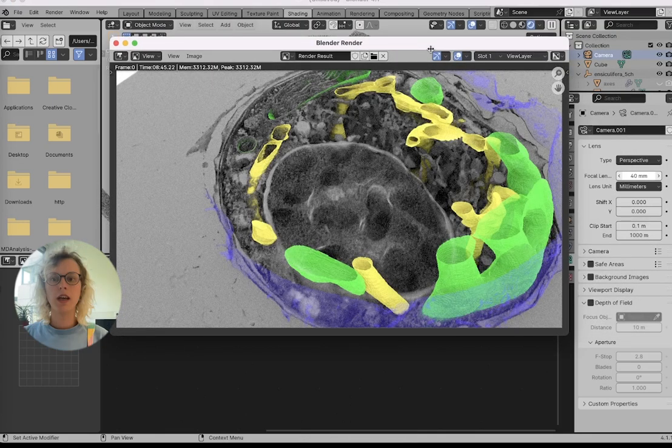So this took a little bit longer to render, and this is for just one frame. We had 8 minutes and 45 seconds. There are some render settings that you could change to make this a bit more doable, but it is this thing where collisions between meshes and volumes and how light paths should be within them is a bit difficult. But you can see that now in this depth, you can really see the mitochondrial cage going through the volume itself, which I think looks really cool. I think this slicing otherwise is a bit weird, but this was just to quickly show it.